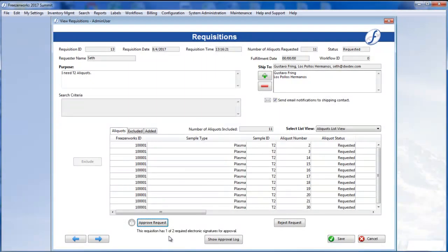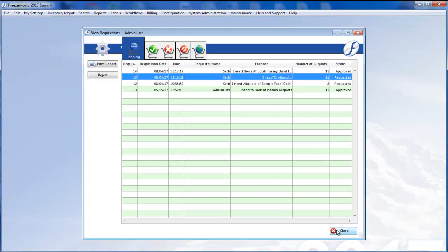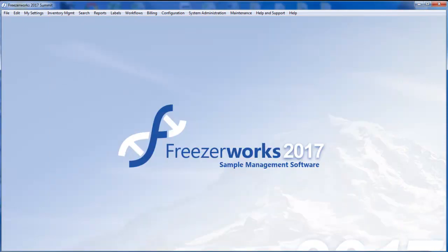I cannot exclude any aliquots, and I cannot add any as well. I will now log out and log back in as another user in order to complete the approval.